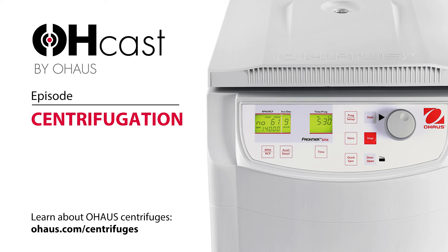Today we're going to be talking about centrifugation and centrifuge safety, which I know is a big topic for a lot of labs. Can you give our audience an overview of what centrifugation is?